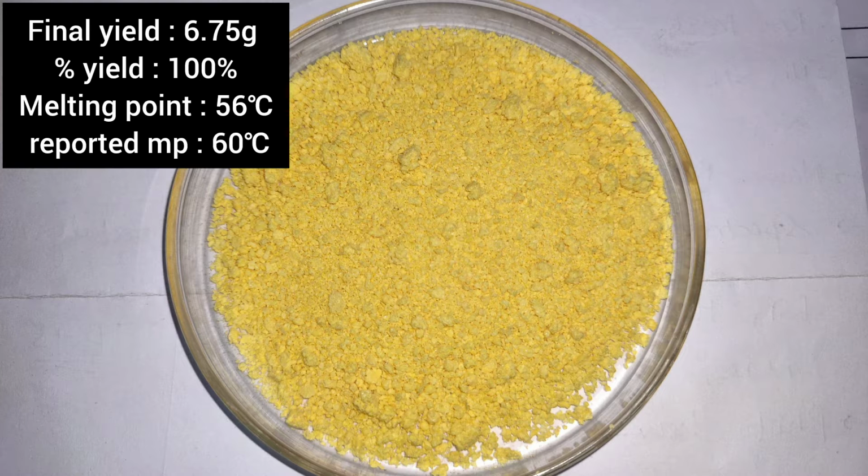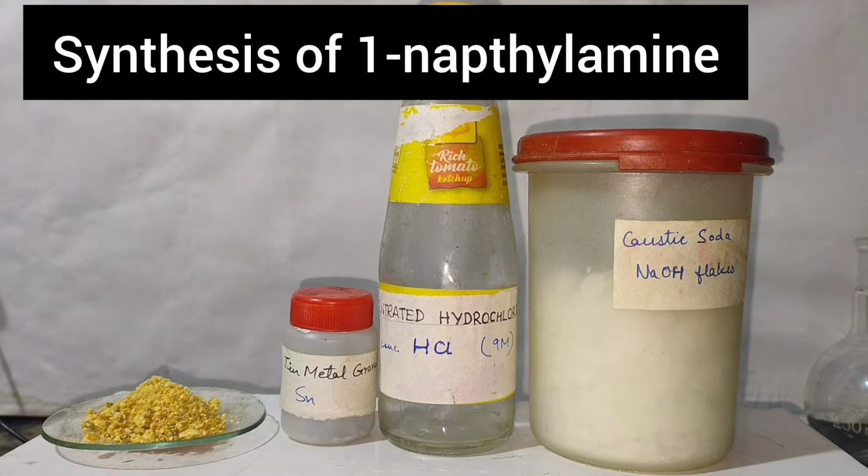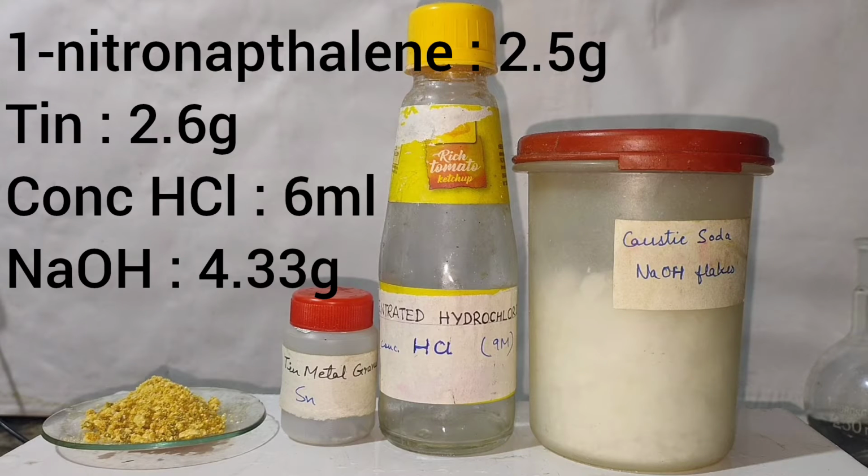So I didn't bother to recrystallize it, as recrystallization would lead to loss of product and the crude is sufficiently pure for the next reaction. Now for making alpha naphthylamine, I took 2.5 grams of alpha nitronaphthalene, 2.6 grams of tin granules, 6 ml of 30% concentrated hydrochloric acid and 4.33 grams of sodium hydroxide.